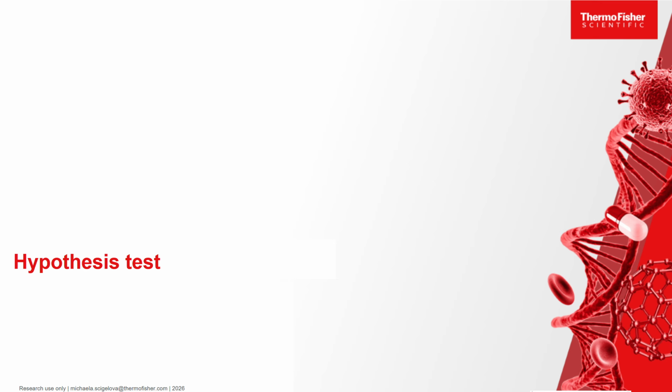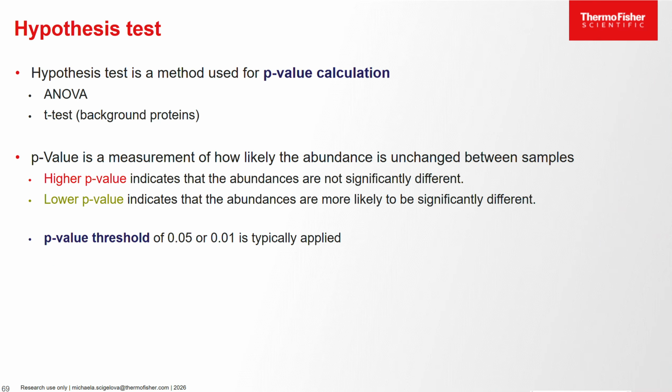And as I said, the new sampler replicate estimation method for protein abundance calculation is taking care of some of this problem of missing values by some automatic imputation there. And we now move on to the hypothesis test. And again, it is a topic I have discussed earlier. I hope we will go through that quite quickly.